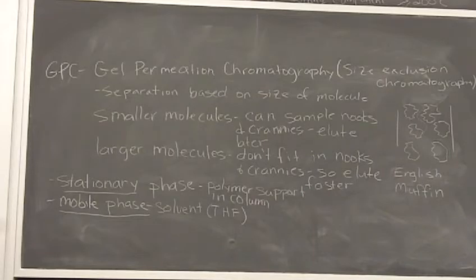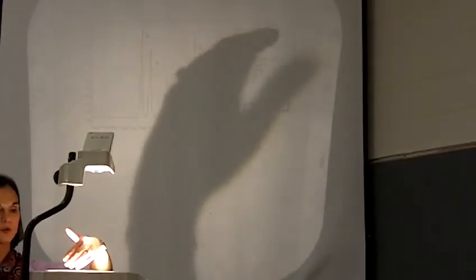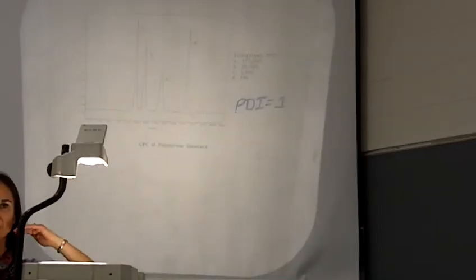The instrument itself, the computer, analyzes the data as it comes out of the detector. And one thing that is run with all of the class samples is standards that have known molecular weights of polystyrene in them. So we're going to run these standards that have a known polystyrene that is a certain molecular weight and only that molecular weight.